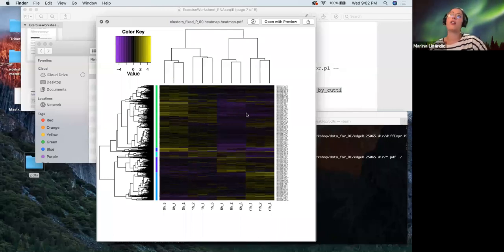And this is all kind of a visualization of what potentially can I explore? And then you move on from this kind of analysis to look at probably some protein level GO term enrichments and focusing on some specific genes of interest.